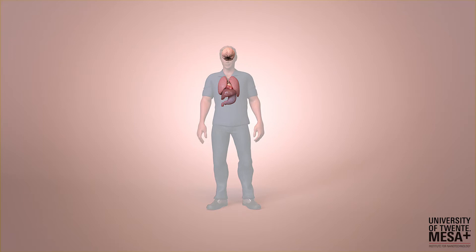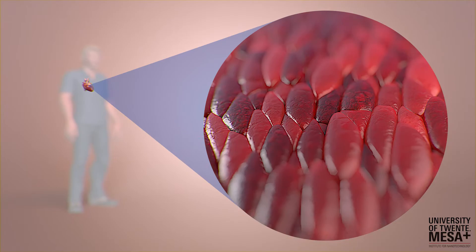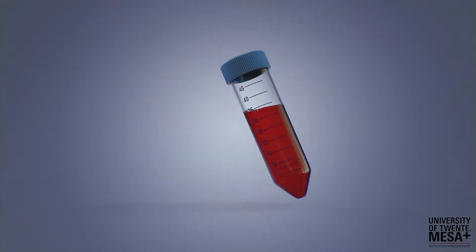We want to find therapies for complex diseases like Parkinson's or heart disease, but animal models are just not good enough to study the human body. We need to zoom in on human physiology. How can we do that?